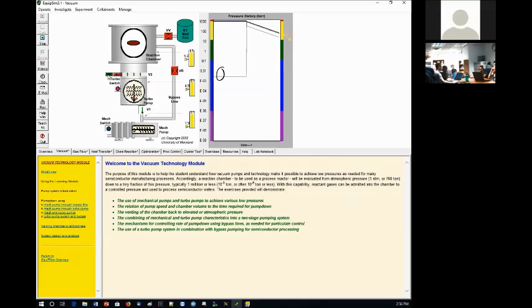Okay, so remember, it took us quite a while to lower down the pressure of the reaction chamber over this bypass line. Do you guys remember? It took us really long, like 5 minutes or so. Now it's taking us much quicker. Any guesses why that's the case? See, we're already at the base pressure now. Why can we pump down the reaction chamber along this line much quicker than this other line here? Any guesses, guys, here on this end?